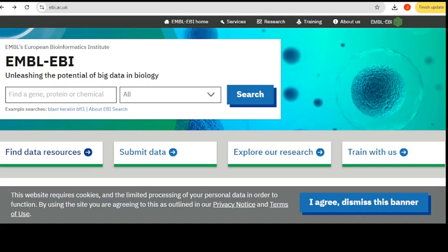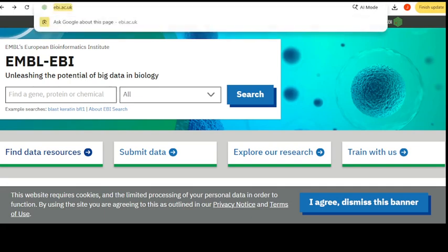All right, this is video number 3. This time we are going into making a multiple sequence alignment. The phylogenetic tree will not take the sequences without first making them align to each other. So if you have 20 sequences, they have to be aligned on top of each other.